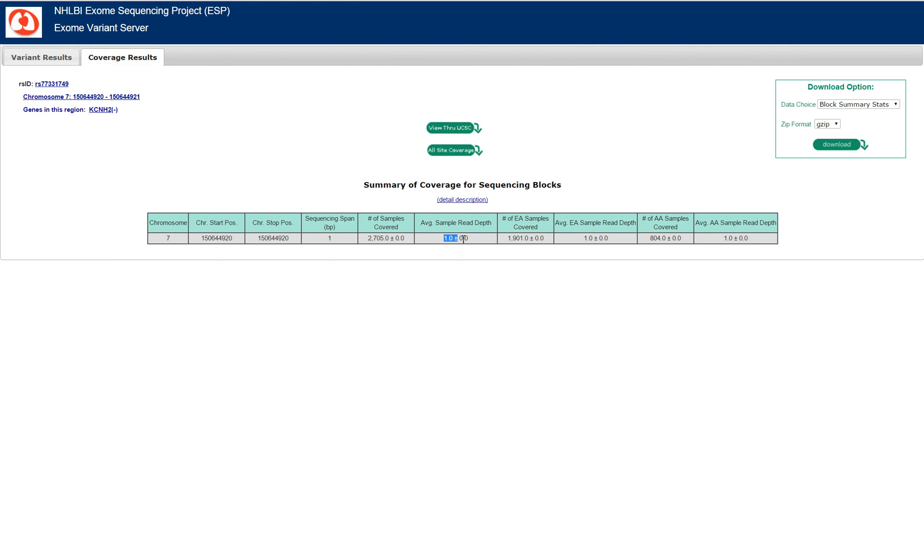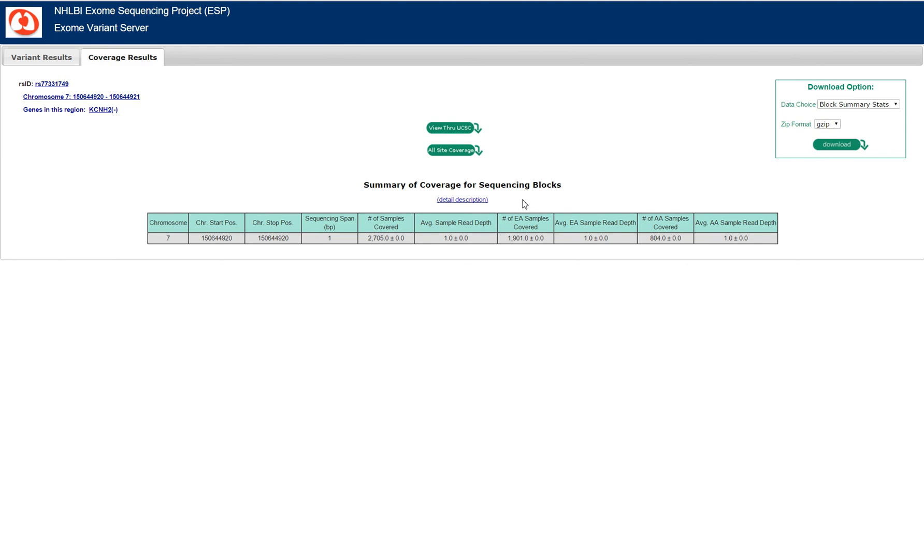You can see the average sample read depth is only one, and they break it down by African American and European American samples. The average sample read depth is quite low, which actually may explain precisely why there was no variant seen. It's either not truly as rare as we suspect because the read depth wasn't good enough and we wouldn't have found those people that are in this database of presumably healthy people, or it truly is rare but we don't have a way to prove it using the EVS and other next-gen databases. Thank you.